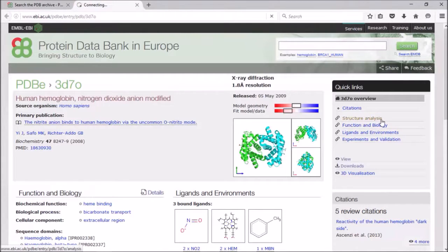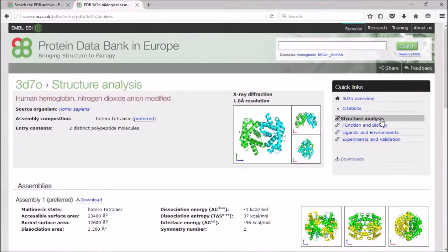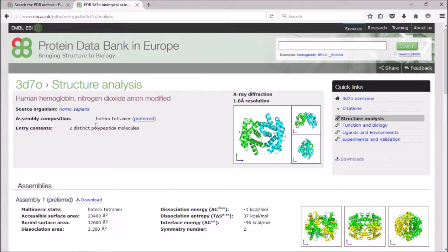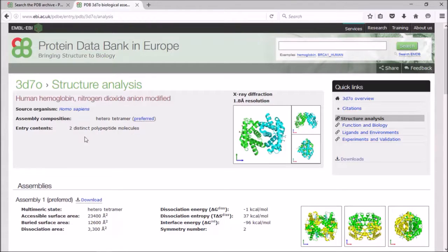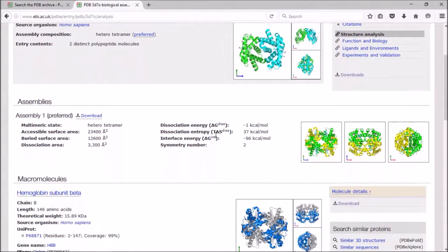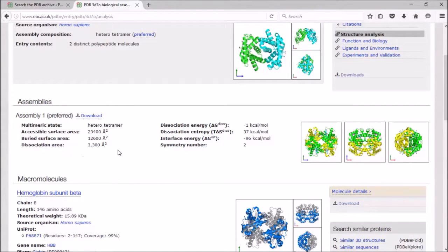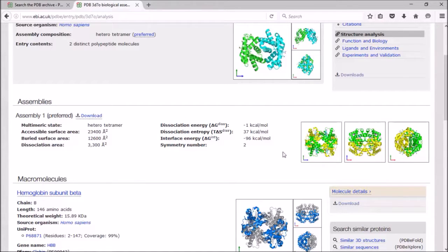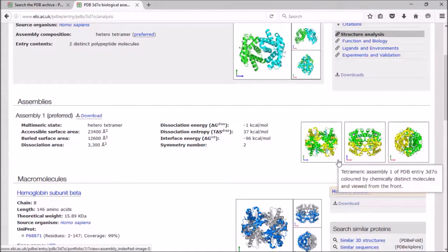This is also found in the structure analysis tab of our entry pages. As you scroll down the page, there's a section for assemblies here, and this gives you information about the surface area accessible and buried, the multimeric state, energies associated with the formation of the assembly, and also images so that you can see what the entry looks like as an assembly.